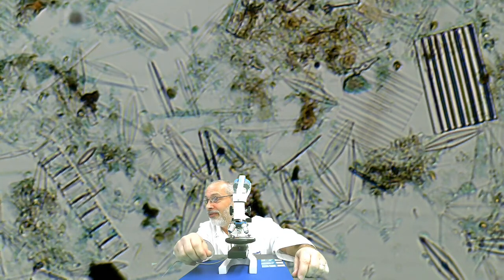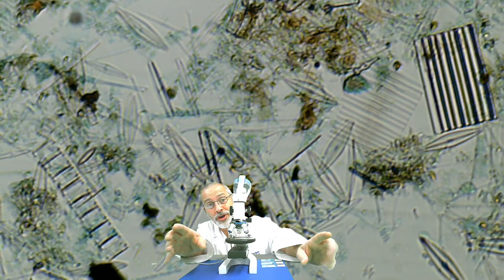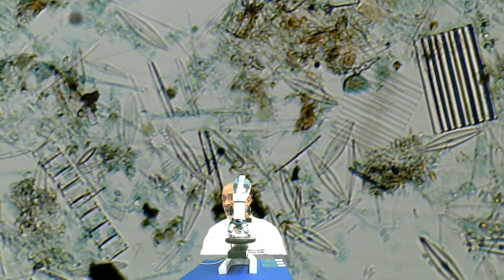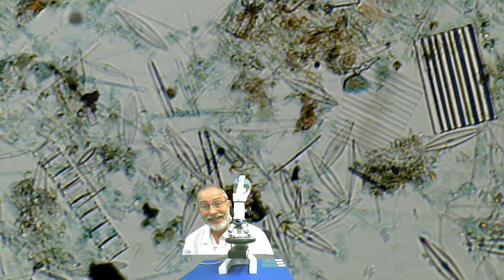So I'm going to leave it right here for this view under 40 times magnification. And again, feel free to add some color to your drawings. 40 times magnification of diatoms. And take notice, this is actually a variety of species. There are many different kinds of diatoms in this particular field of view. I'm just picking out 1, 2, 3, 4, 5, 6. There's at least a half dozen different varieties or species of diatoms here, all of which are pretty cool.